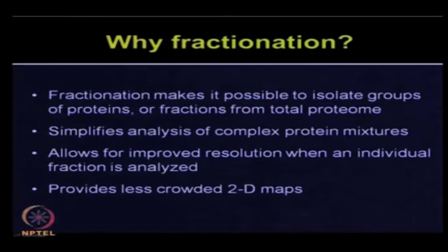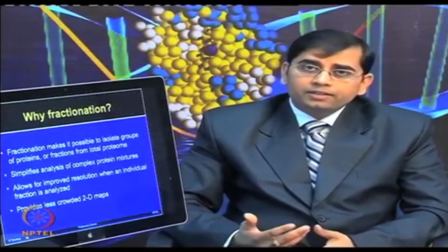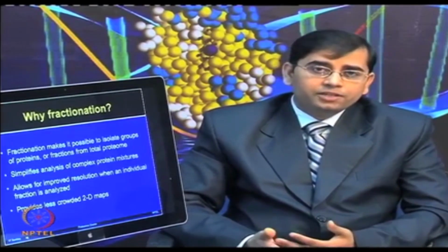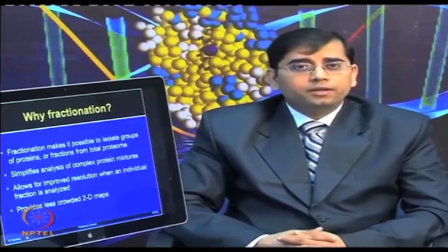This method can further allow improved resolution of proteomic data, and when you obtain data from individual fractions and pool it together, it is going to be more informative. When you apply your protein samples on a 2D gel or other gel-based proteomic techniques, this will provide you a less crowded protein map. So, again, fractionation can serve a good need in both gel-based and gel-free proteomic applications. Let us talk about the different types of fractionation methods available.